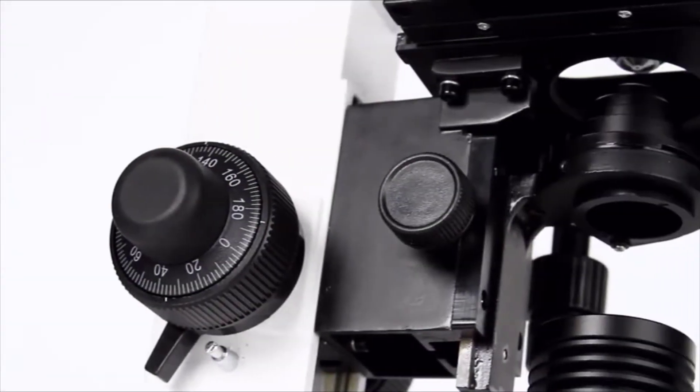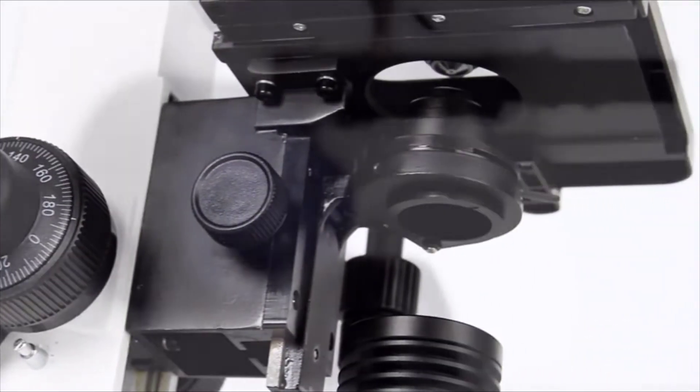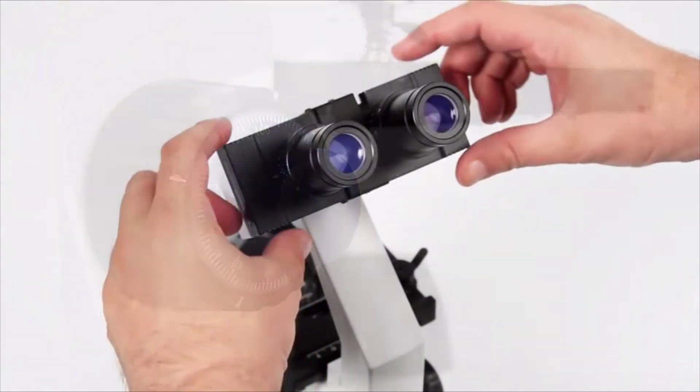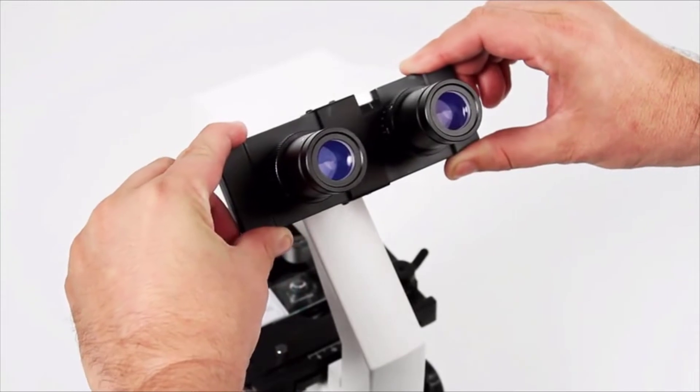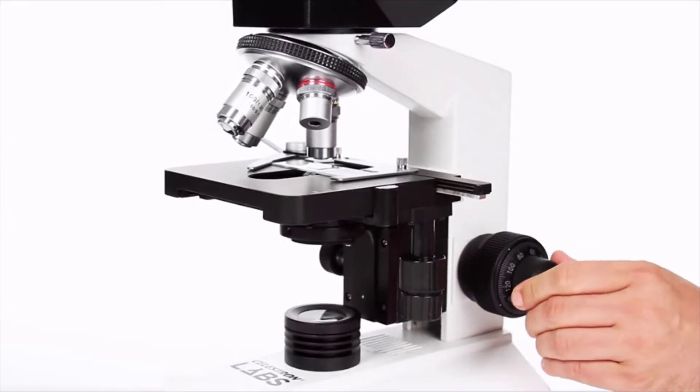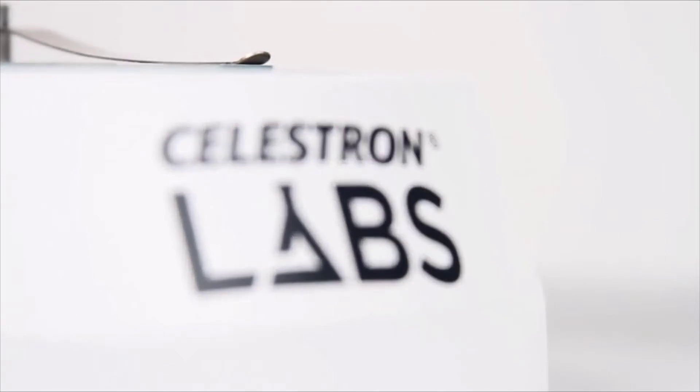Select models offer advanced features, like an Abbey condenser or coaxial focus, while others are battery-powered for use in the field. Two models even offer a binocular head for comfortable, extended viewing sessions. The possibilities are endless. Choose your Celestron Labs microscope and begin your exploration.